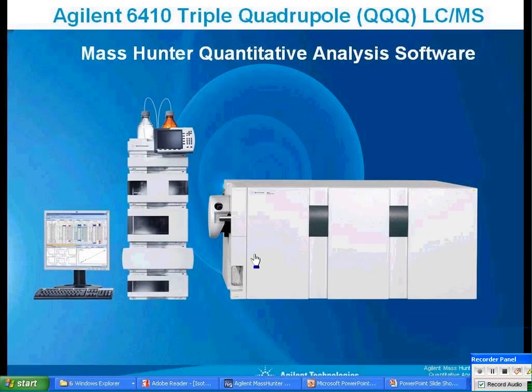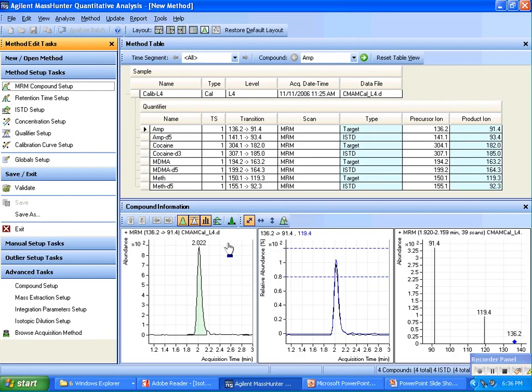Looking at different modes, different scan types that are available in the triple. Looking at the method editor, we're typically setting up an MRM method. It's the large role of the triple in quantitation. You can see here we go through those steps as we've described.